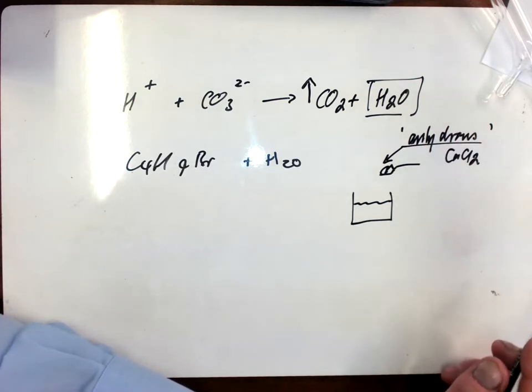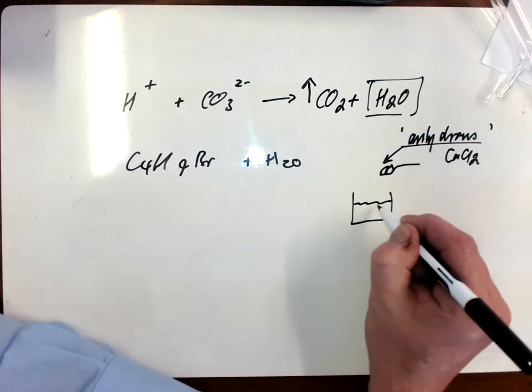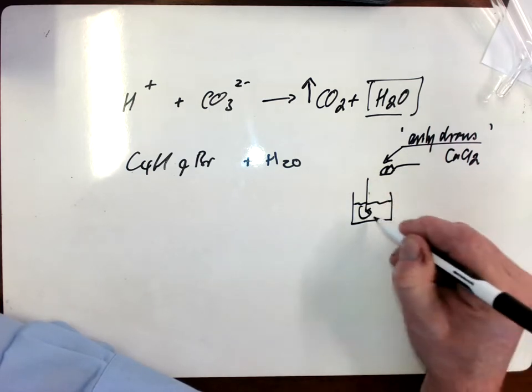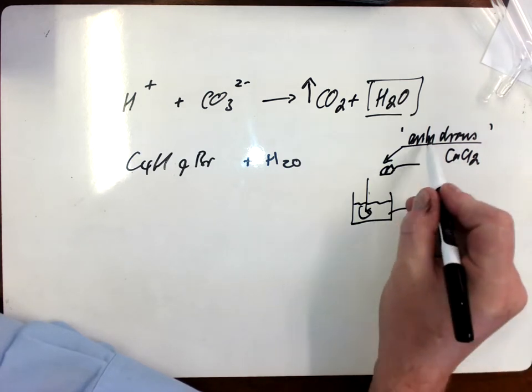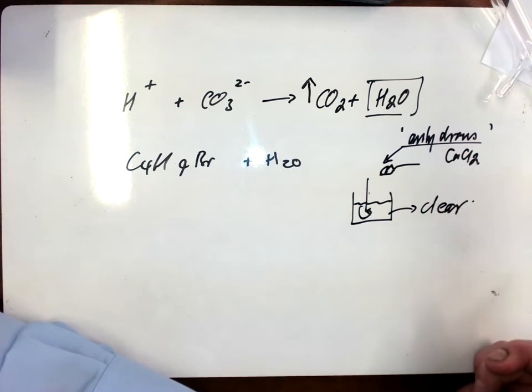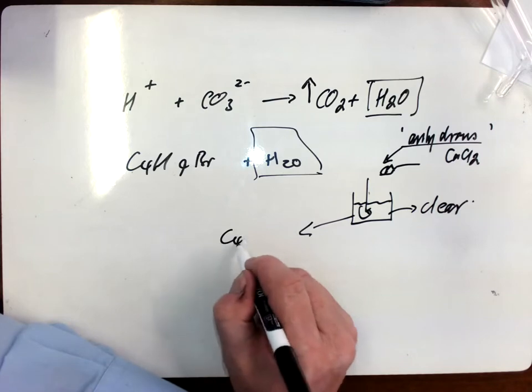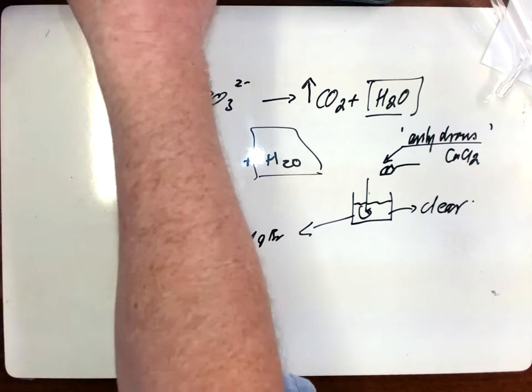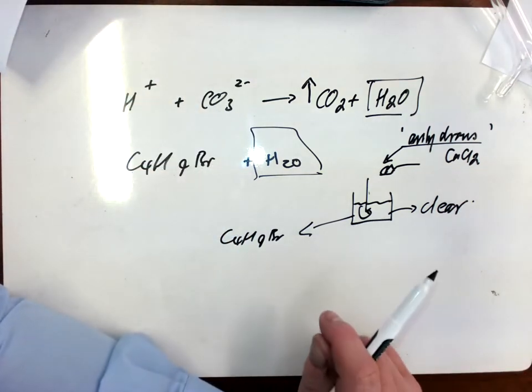Okay, other ones are things like magnesium sulfate, sodium sulfate, okay, but anhydrous calcium chloride is the one that we use, and we just put that in and we give it a bit of a stir up, okay, until the whole mixture goes nice and clear. And at that point, the anhydrous calcium chloride acts a bit like a sponge and has absorbed the last few molecules of water, and now you have a fairly pure C4H9Br on your hands.